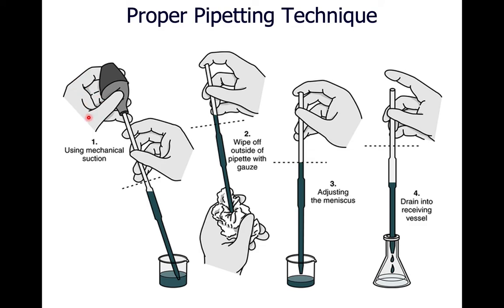The reason is, if I took this hand here and left it where it's at and took this hand way down to the bottom, any force that I apply has quite a bit of torque to it, and it's easy to snap this. If we snap the neck, it's very easy for us to cut ourselves at the point that we do break it. What we want to do is, in general, keep our hands pretty close together.